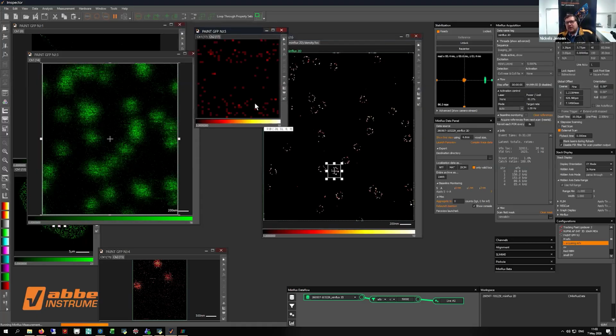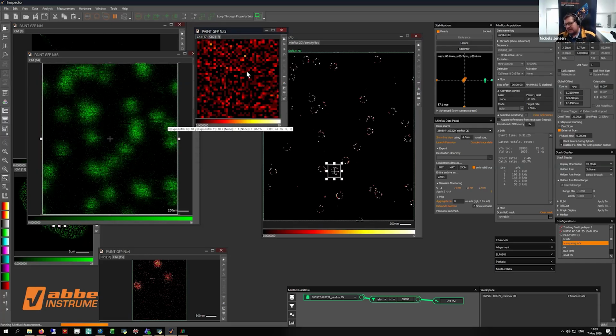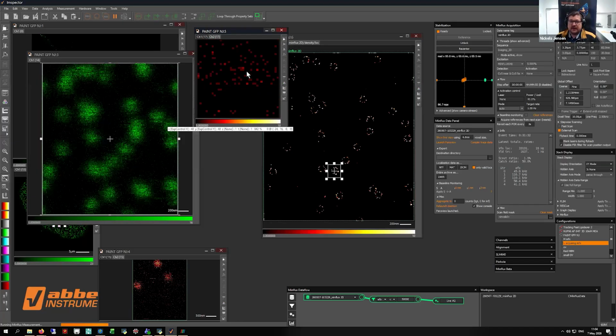While we image, we see here this blinking window. This is just a detector window that shows us if we have a signal. So at some point you get used to it. If it's dark, it's not localizing. We are just scanning and looking for a single event. And if it's a very fast blink there, then you see that we localize a molecule. When you start this, you get a feeling very easily how this blinking behavior should be.